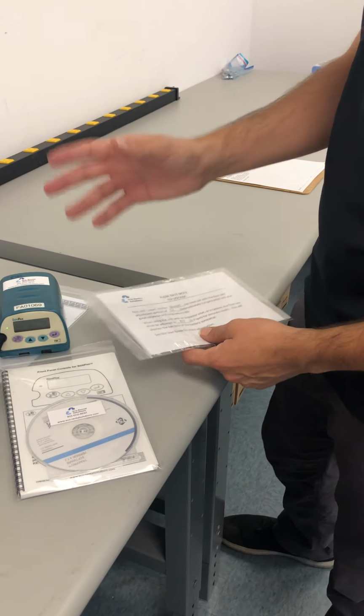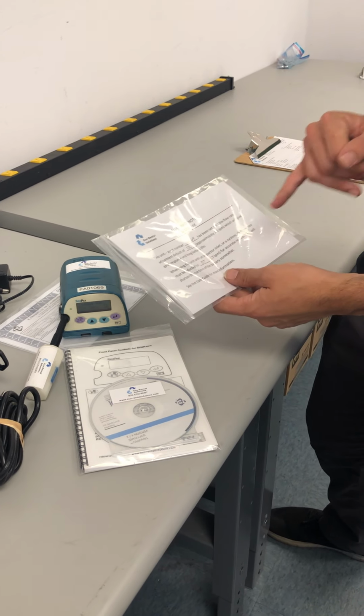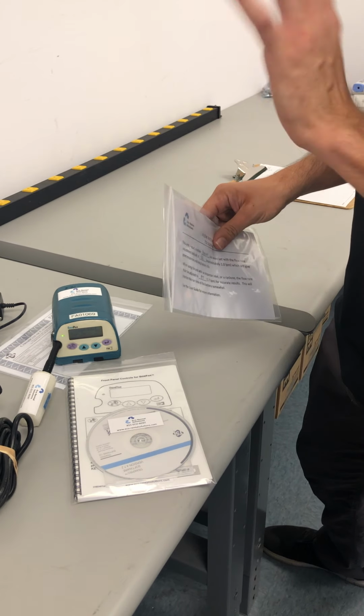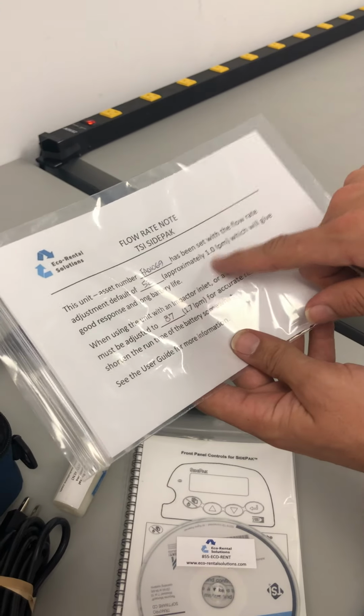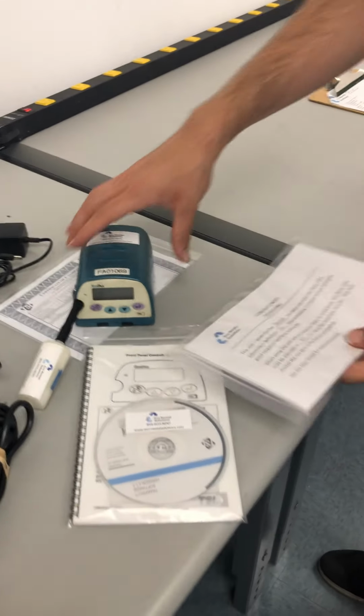However, if you're using an impactor, they recommend to run it at 1.7 liters per minute. Got it. There's a screen where you can adjust the flow, and we've already got these for you so that you know exactly what number to set it for to get to 1 liter and what number to set it for to get to 1.7 liters. Great. And I'll show you where that is as well.